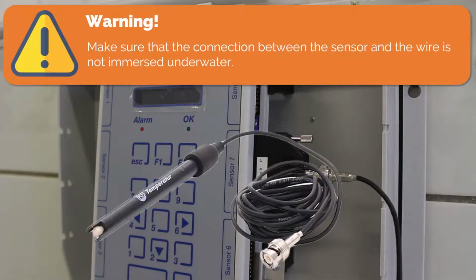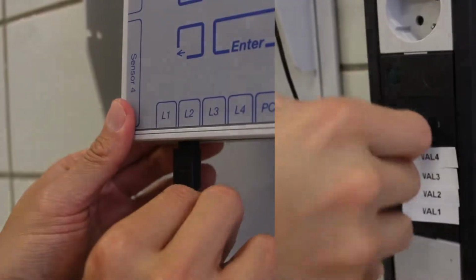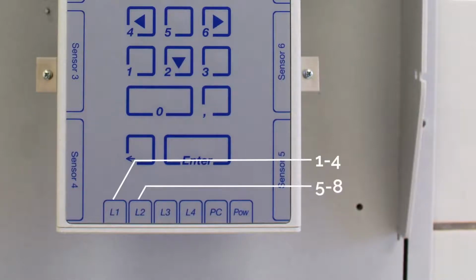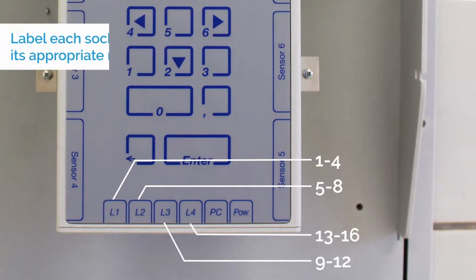Warning: always make sure that the connection between the sensors and the wire is not immersed in the water. Next, connect the switch socket panels to the bottom sockets L1 to L4. Sockets are numbered based on their connections to IKS. Numbers 1 to 4 are assigned on the sockets of L1, numbers 5 to 8 on L2, numbers 9 to 12 on L3, and numbers 13 to 16 on L4. To avoid confusion, label each socket with its appropriate number.